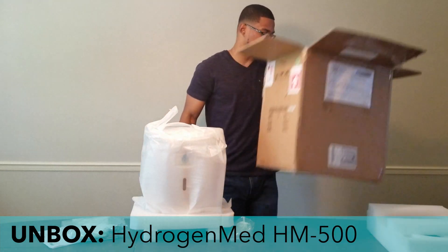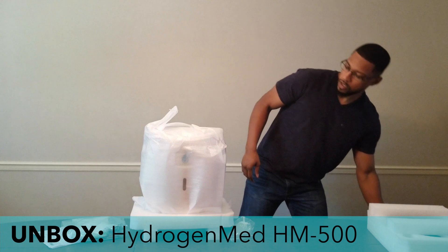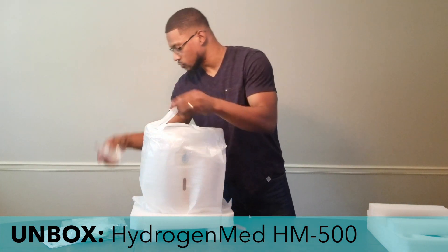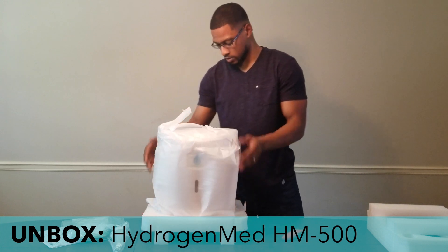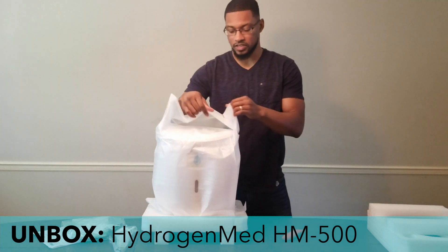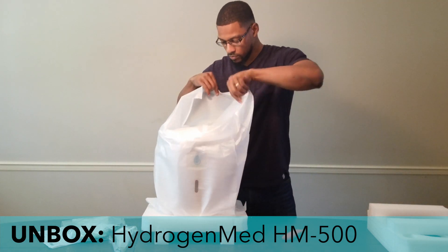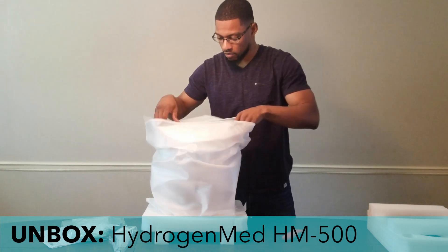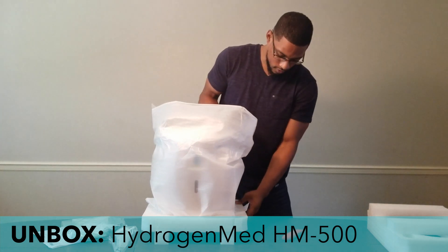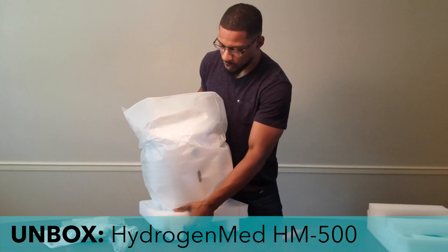The box looks like this — it comes well protected in shipping. This is the front side of the system, and we'll take the actual unit out from the bottom.